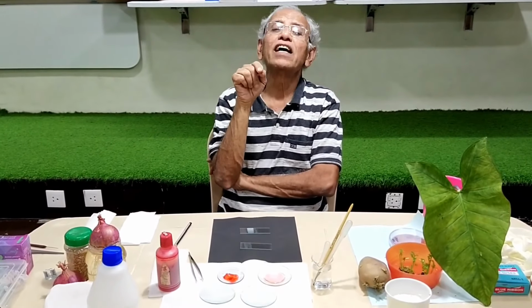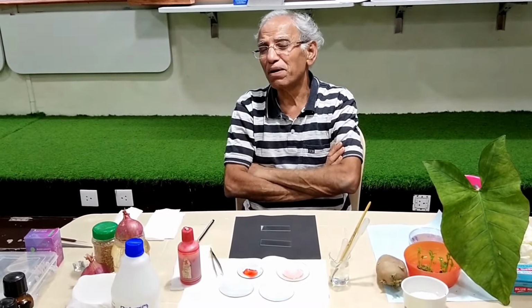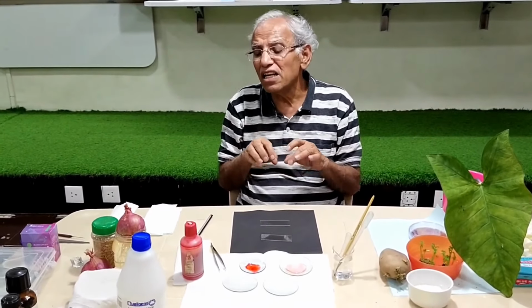By fixation, what it means is the proteins inside the cells get stabilized, and then staining is possible. If you take fresh skin and then try to stain, the staining will not be so good, because the proteins are unstable, they are still scattered.